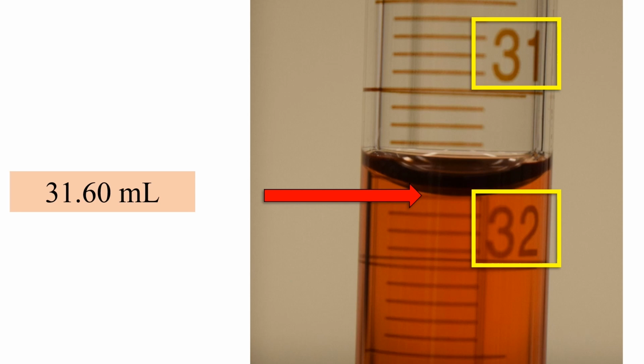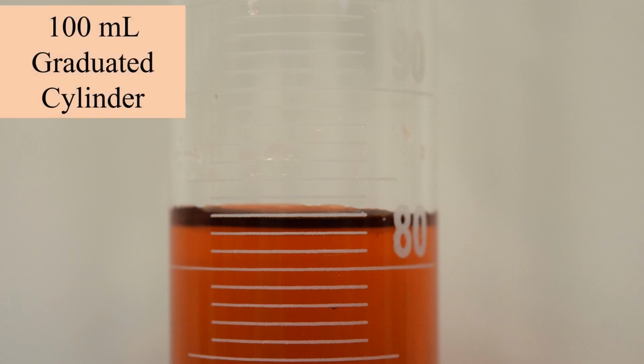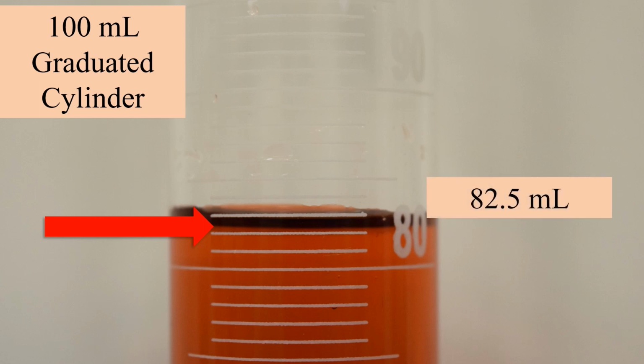Now, let's take a look at graduated cylinders. Here is a 100 milliliter graduated cylinder. You'll notice that the graduations are going upwards. Recall, cylinders and beakers are meant to contain volumes. These 100 milliliter graduated cylinders read every 1 milliliter, so you see we have less resolution. With wider cylinders, the meniscus is flatter. Here, we are certain of 82 milliliters, and you can see the meniscus is slightly above the 82 milliliter graduation. I'll estimate a tenths value of 5 and report 82.5 milliliters, three significant figures.